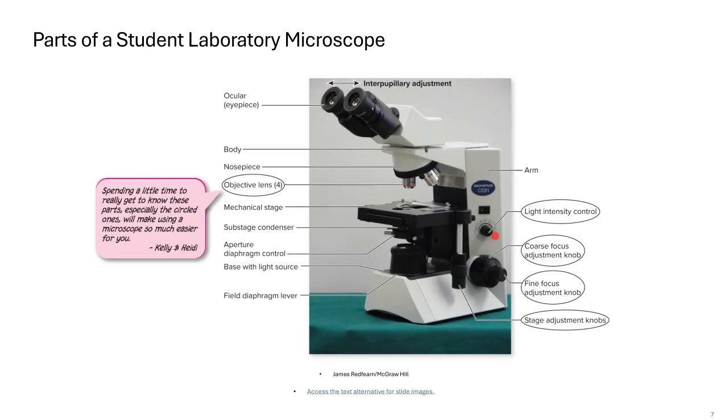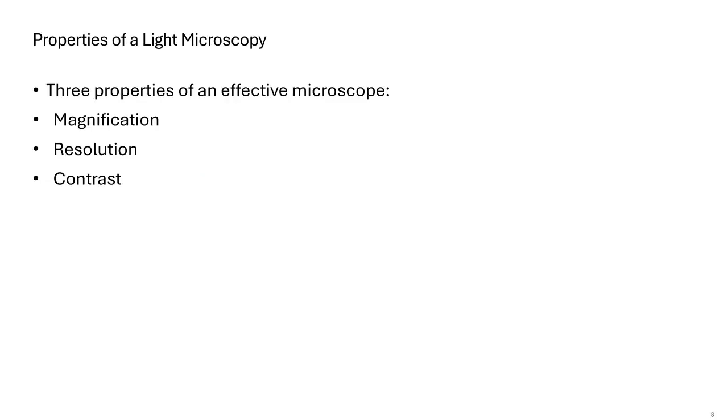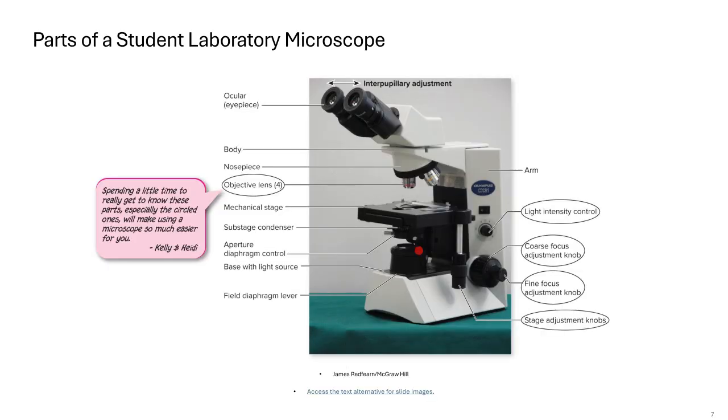Sometimes there's a light intensity control on the body of the microscope. Usually that light intensity depends on how you turn on your light down here. You may have a dimmer switch. You may have a light switch that turns it on. That varies quite a bit from microscope to microscope. Let's go back to the clips. Slide clips, you can see these two silver metal clips here on top of the stage. Those open up and you slide your slide in where it secures into those clips.